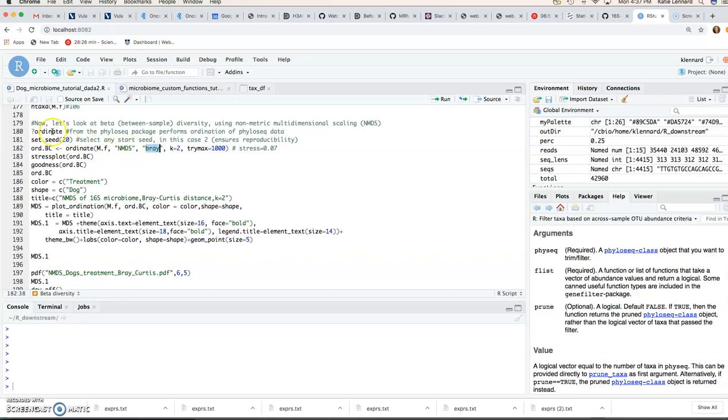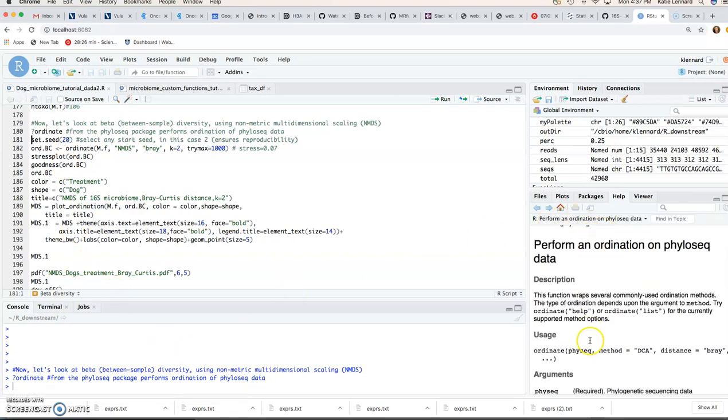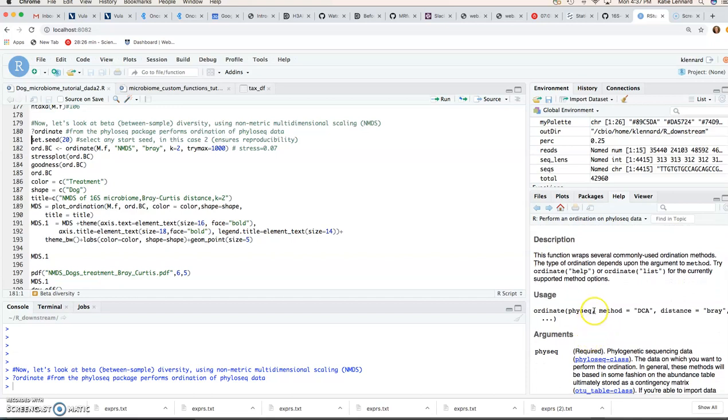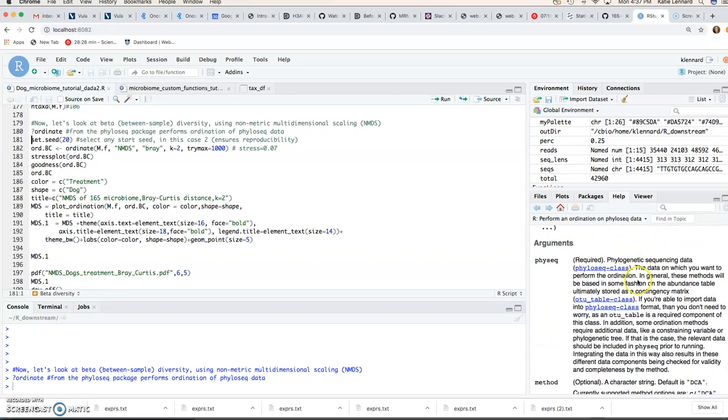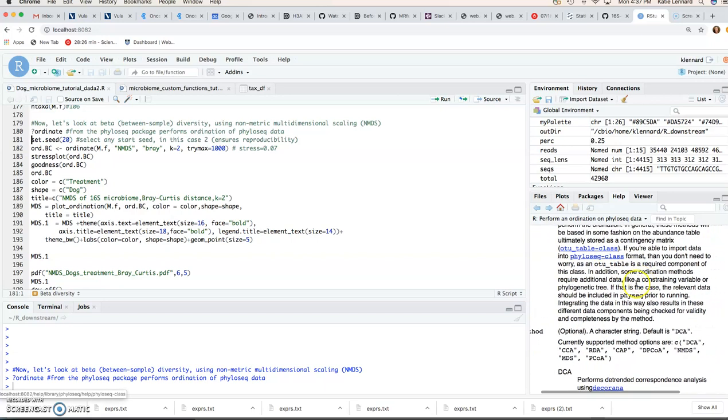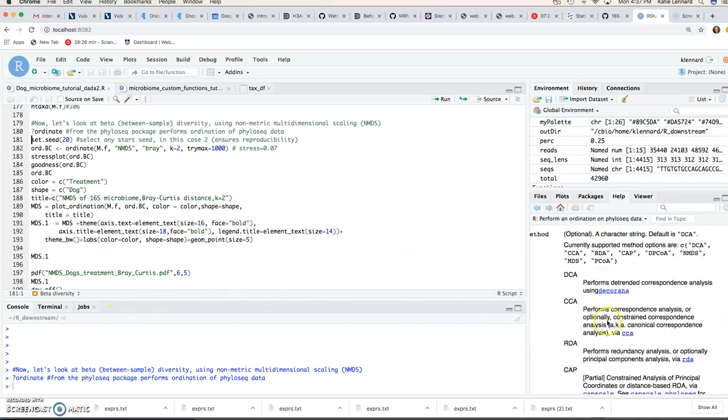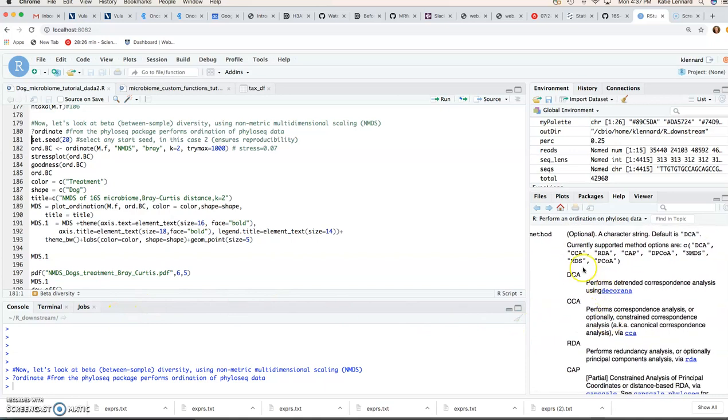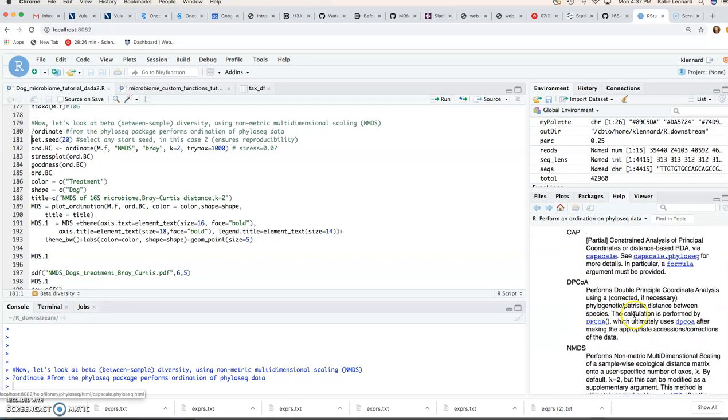So we can use the ordinate function, and that's also from the phyloseq package, and the first parameter again is a phyloseq object, and then after that you can select the method you want to use. So you'll see there are a number. We discussed PCOA and NMDS, and here you'll see MDS and PCOA are the same thing, like we discussed.